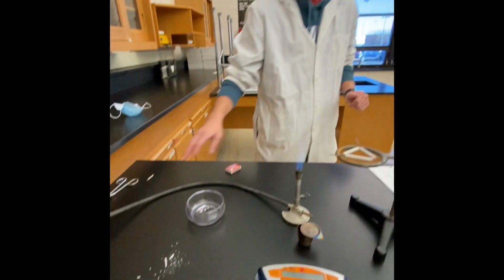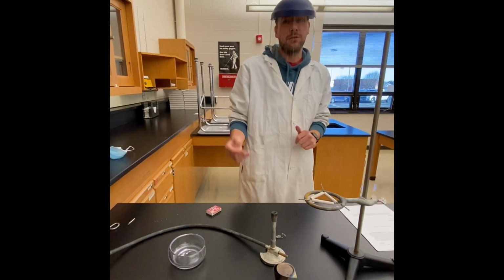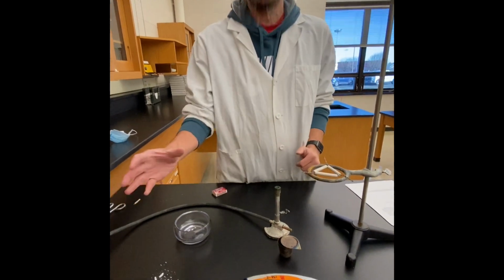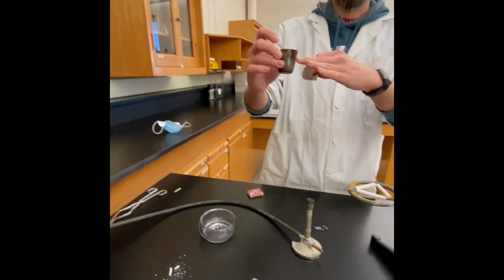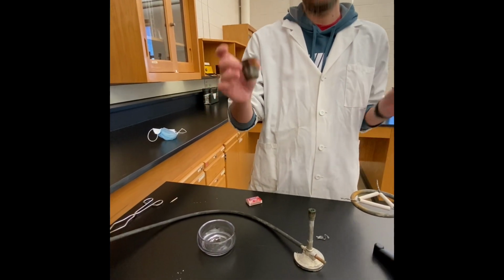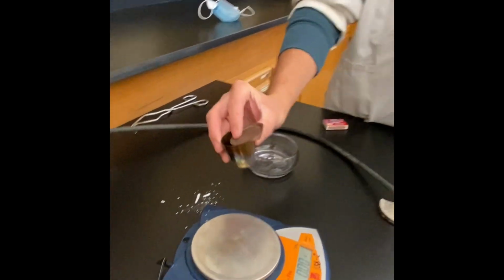So we need to do this experimentally and collect data so that we can determine the formula of magnesium oxide. To do that, we're going to run that same reaction in this container, which is called a crucible. The first step we're going to need to do is to get the mass of the crucible with the crucible lid. So I'm going to put that on my zeroed out balance.